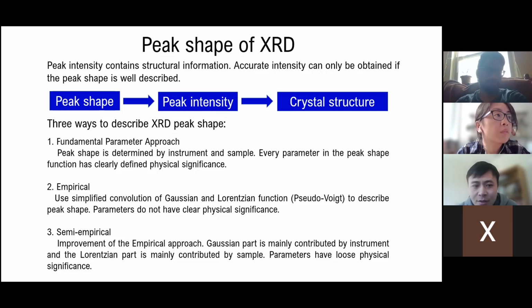This is a physics-intensive approach, meaning that people try to understand every detail of the X-ray diffraction process.